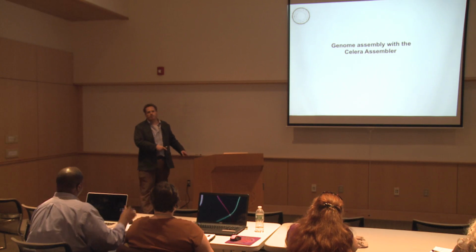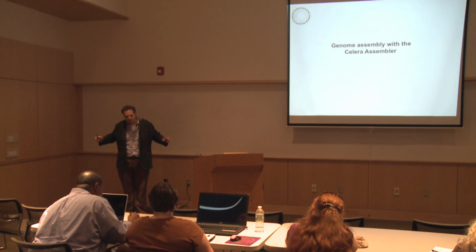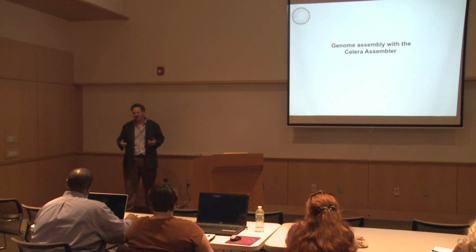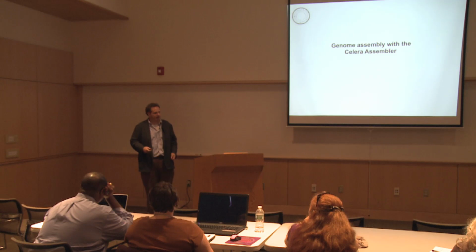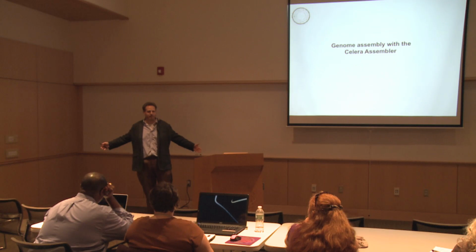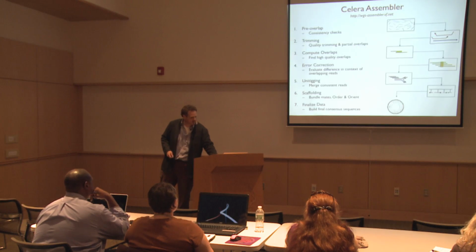Sometimes much, much worse, right? So in Nature a few months ago, there's a publication of the wheat genome. In reality, what was assembled were these very short contigs, where the N50 size was like 2 KB. So it's not actually anything resembling chromosomes. It's these little 2 KB fragments. That's the state of the art with short read sequencing. So if your project really requires bigger than that, that's where we need to look at long read technology to take it to the next level.